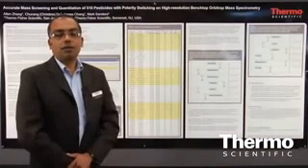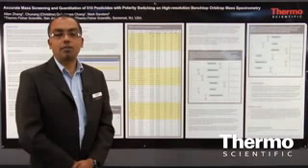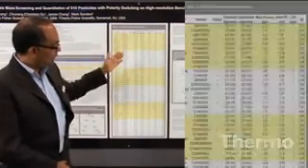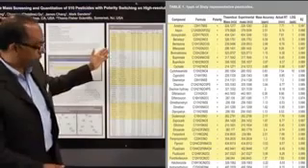And the Exactive Orbitrap platform is an ideal instrument for this because it operates in high resolution mode and has extreme high mass accuracy. Typically we can achieve mass accuracies to less than 2 ppm. And here what we have is an example of 60 of these pesticides, a snapshot of the 510. And I'll just take you through what we're displaying here.